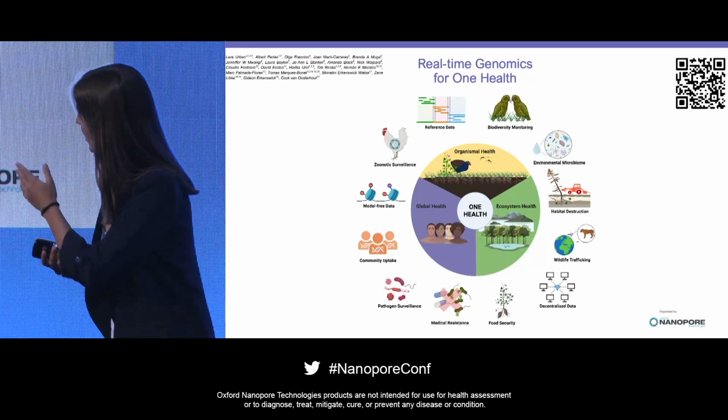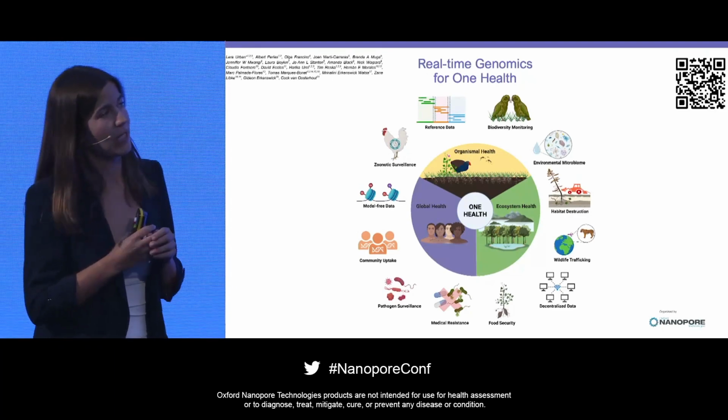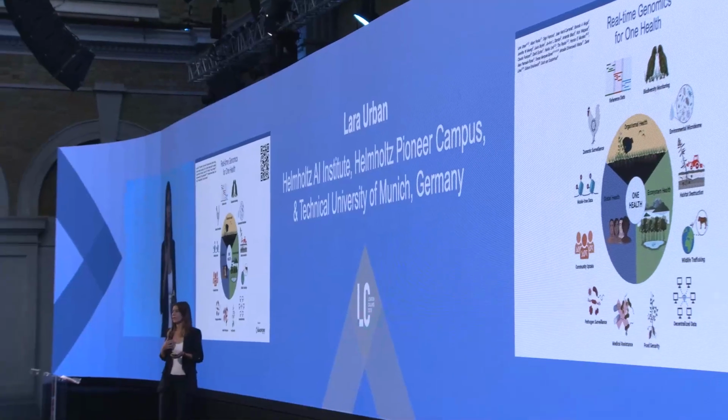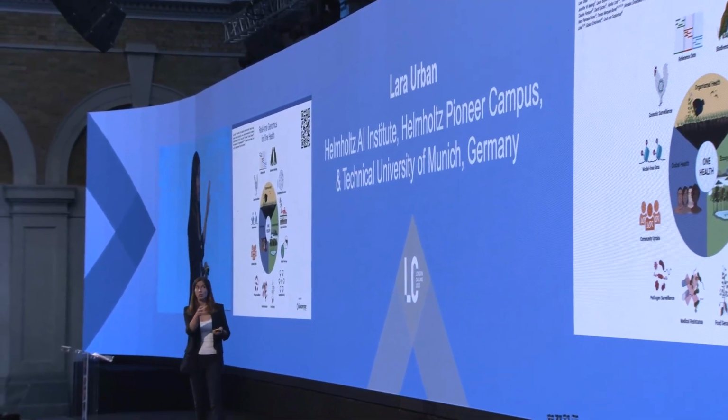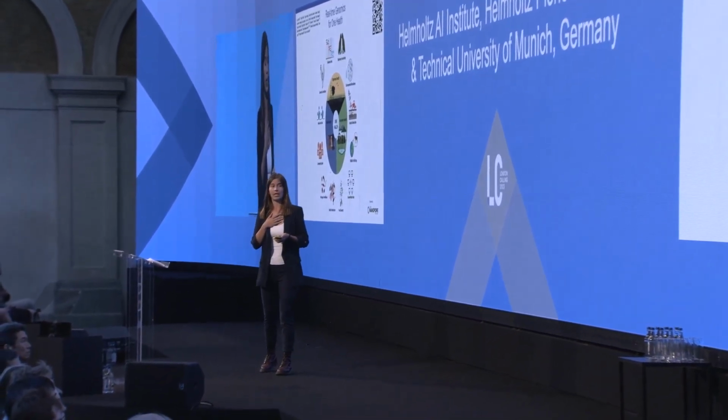We can think about pathogen monitoring in the clinical setting, detection of resistances, but also contribute to food security. We further talk, as you see here on the left side, about in this perspective article how the model-free data modality of the nanopore read data, of the squiggle data, can be used in all these sorts of applications to give us really additional information, and I will bring forward an example about that later.